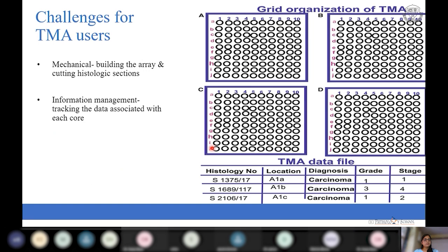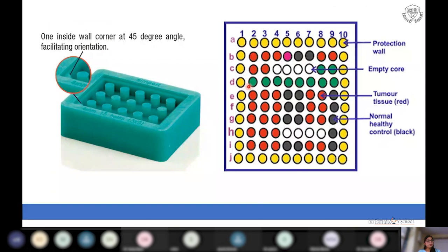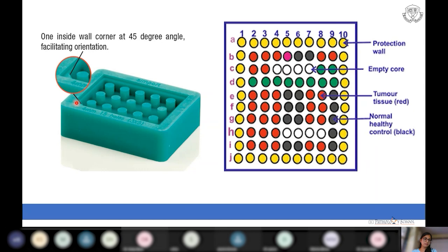TMA users face two categories of challenges: mechanical challenges faced by technicians during TMA construction, and information management challenges faced by researchers and pathologists recording data. To address information management, individual quadrants are represented using capital alphabets, and individual cores are located using numbers and small alphabets. Some laboratories use color coding for easy identification during data recording. To decrease mechanical errors, markers are placed in molds — for example, a 45-degree angle marker helps technicians avoid errors due to disorientation.